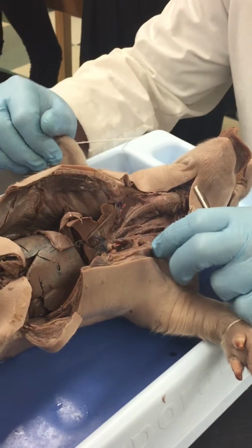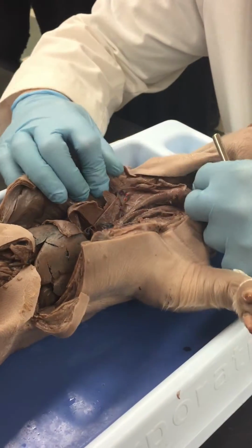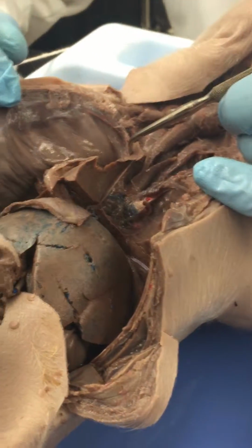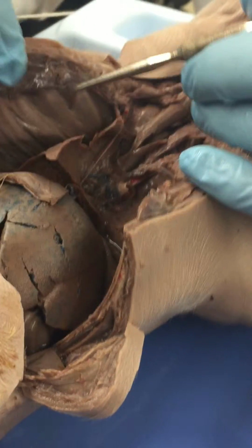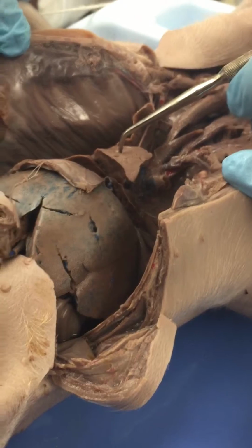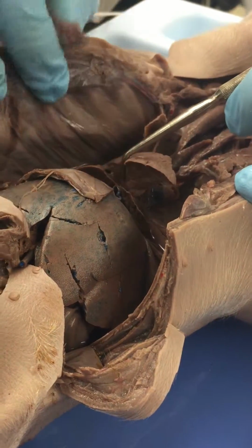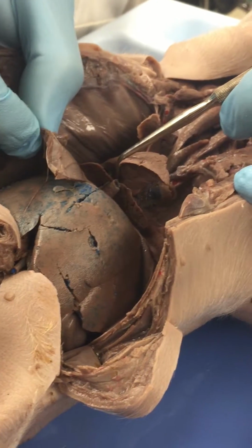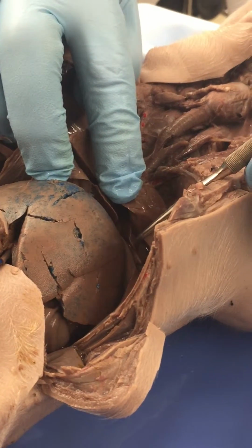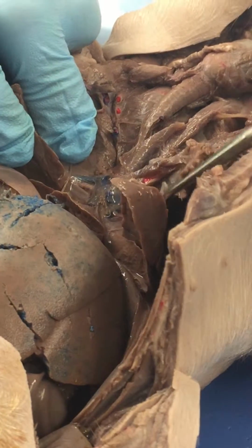Okay, the lungs have 7 lobes. You need to know the names of all of them, and be sure to give me right and left. So they are, this is the right apical lobe. This is the right cardiac lobe. If the heart were here, it'd be kind of wrapping around the heart. This is the right diaphragmatic lobe, which sits on the diaphragm. That's why it's called that. Likewise, there's going to be the same on the other side. This is the left diaphragmatic, the left cardiac, the left apical.